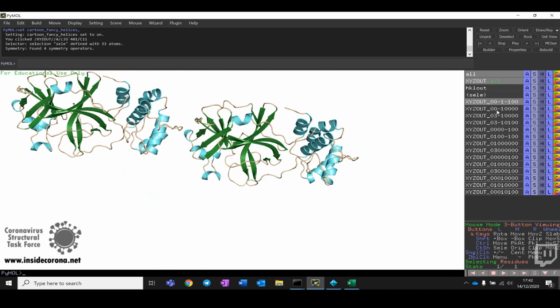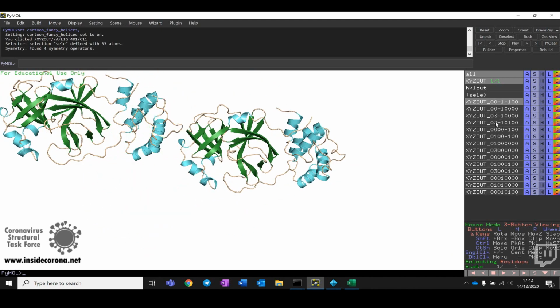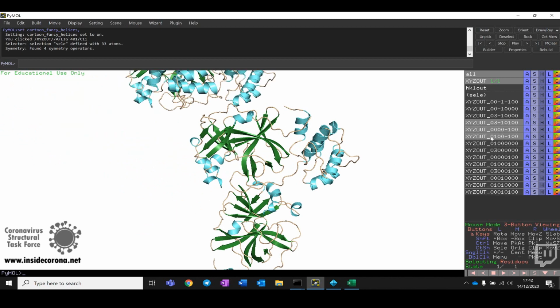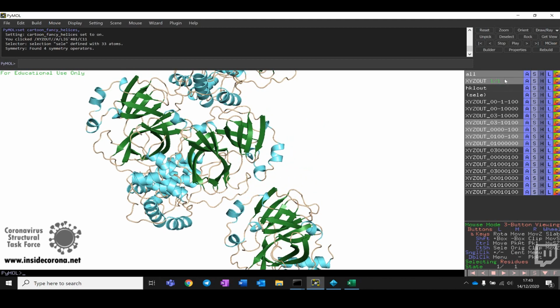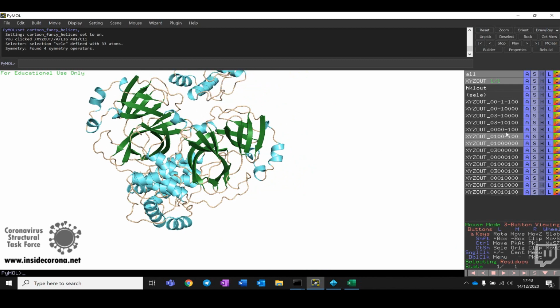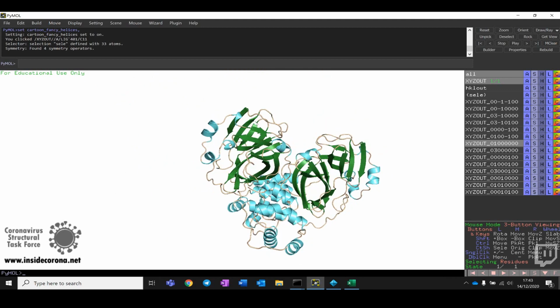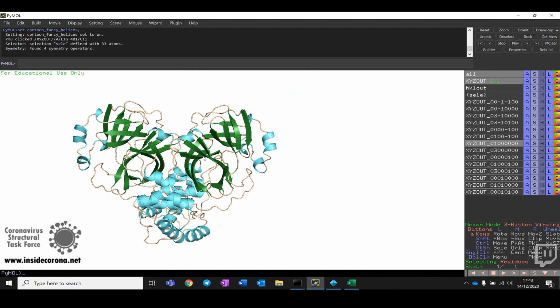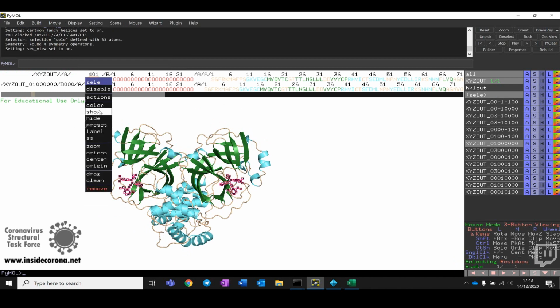And we can recreate that dimer if we can find the right symmetry-related molecule. So we'll just flick through these and hopefully we will find the related one. There we go, that's the one. So we'll just turn off these other ones. And there we go, there is our full protein. And I think the ligand has disappeared, so let's just show that again as sticks.